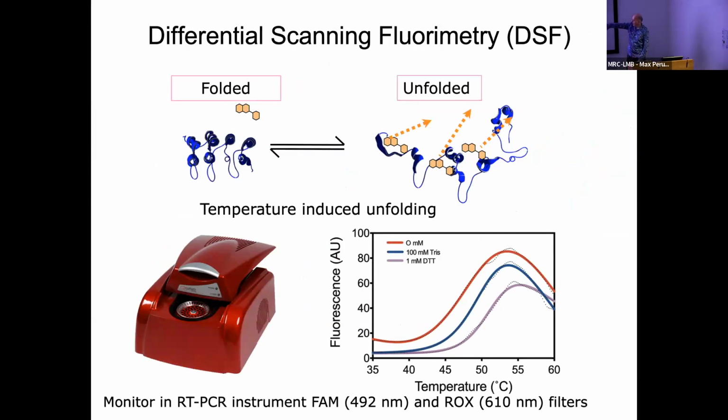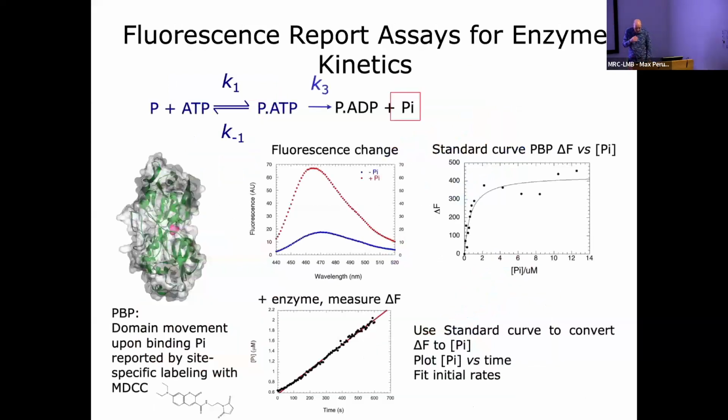The data you get out is a bit sloppy, again because the fluorescence is temperature dependent, but also at high concentrations you might get more aggregation, which changes the binding.